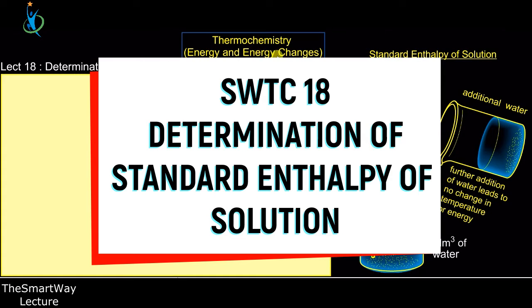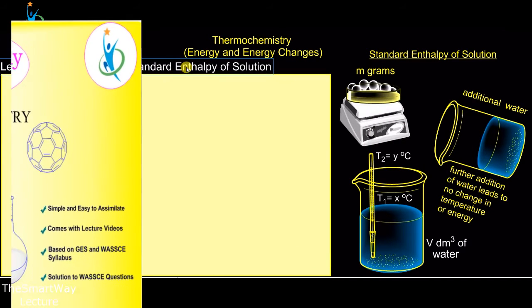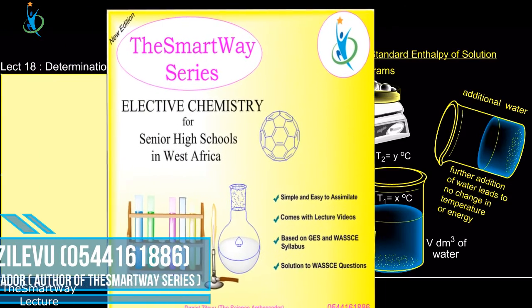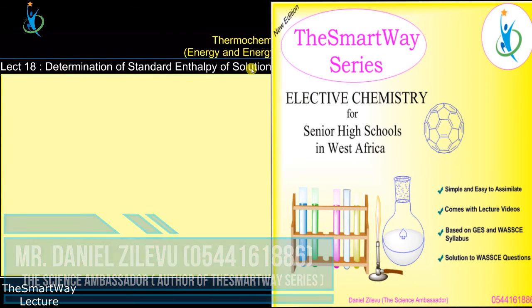This is a series of lectures we are running on all the areas in science, and today we are going to help you to determine the standard enthalpy of solution experimentally. We are going to do the experimental determination of standard enthalpy of solution.